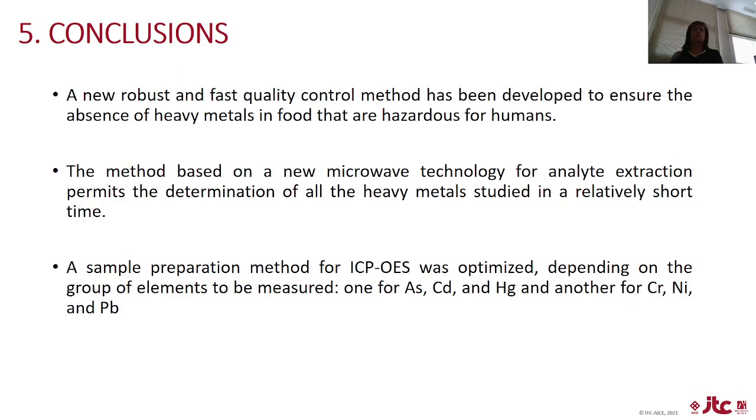To conclude, we can say that a new robust and fast quality control method has been developed to ensure the absence of heavy metals in food that are hazardous for humans. The method, based on a new microwave technology for analyte extraction, permits the determination of all the heavy metals studied in a relatively short time, less than 2 hours.